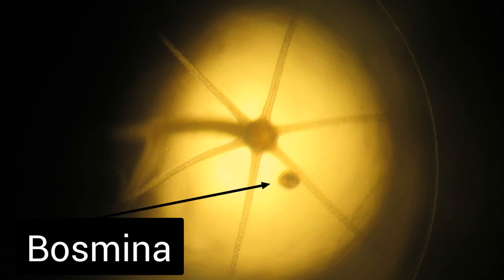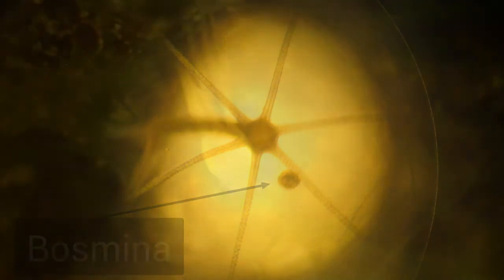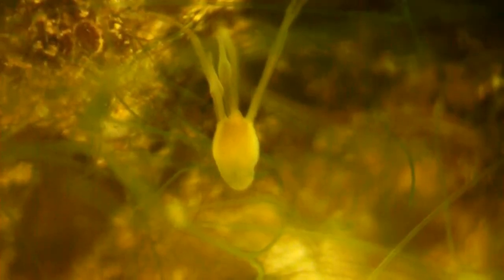Like many other microorganisms we've seen here, hydra reproduce asexually when conditions are nice and sexually when conditions get harsh. This is a hydra during asexual reproduction. They produce a smaller clone of themselves, called a bud, which grows until it breaks off from the parent. Although hydras can eat basically anything they can catch, they can only stay alive if there's enough to feed them. Imbalances in population and diversity can be deadly to every microorganism.